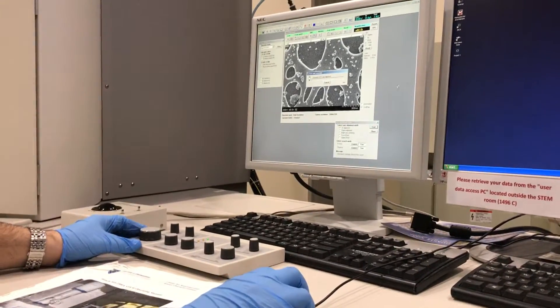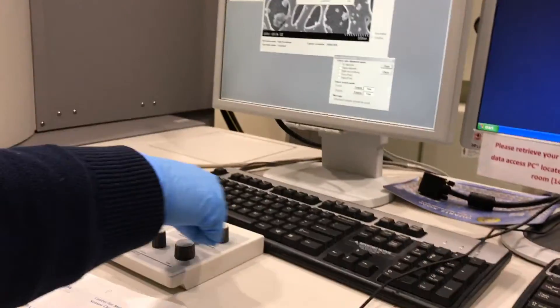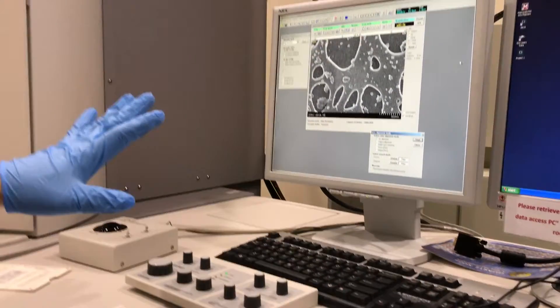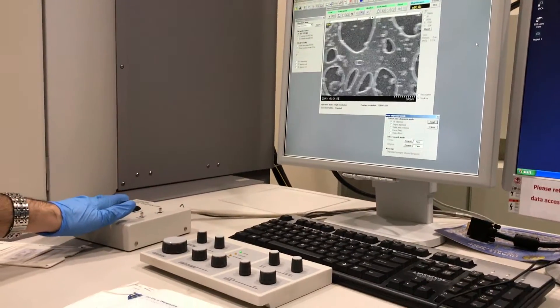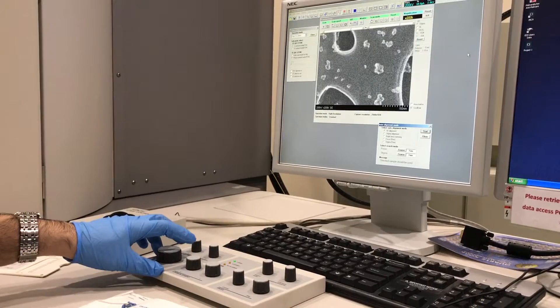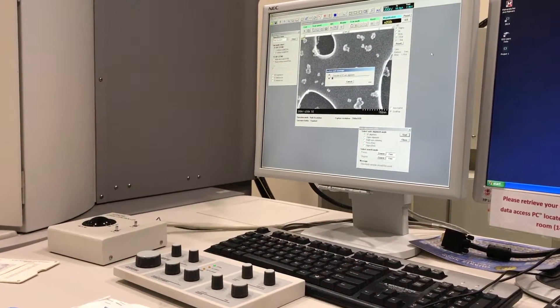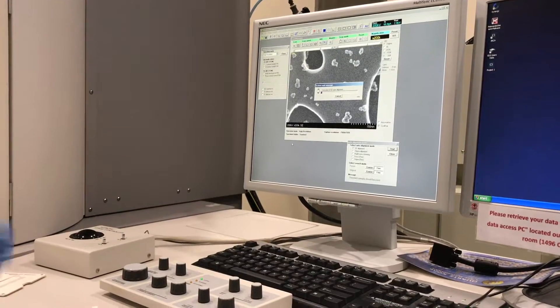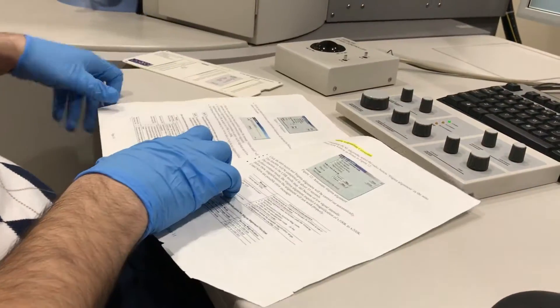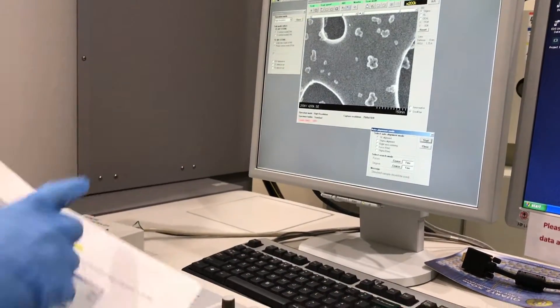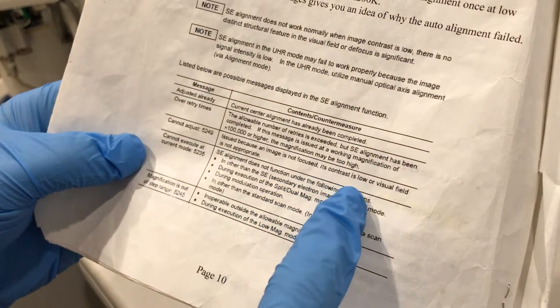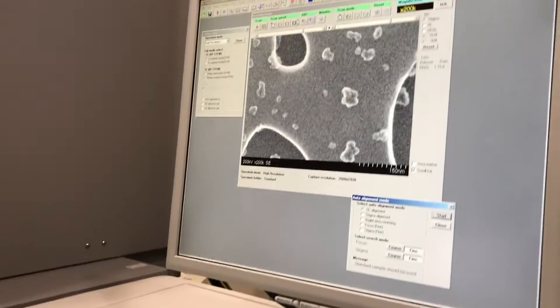Now zoom out and start SE alignment. Make sure your brightness and contrast are good — you have an area of image with features on the screen for the software to pick up and align the microscope. If there is a problem, you will see an error, and you can troubleshoot it by using the error table. If the image is not focused or the contrast is too low, you'll see an issue. So do auto brightness and contrast to fix this.